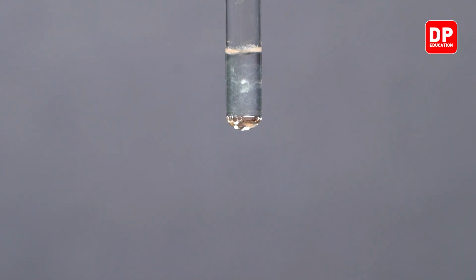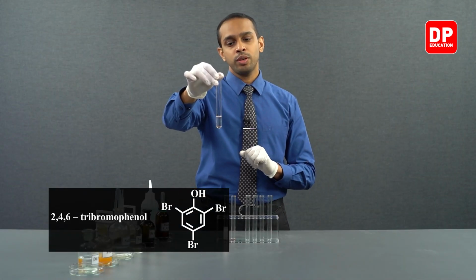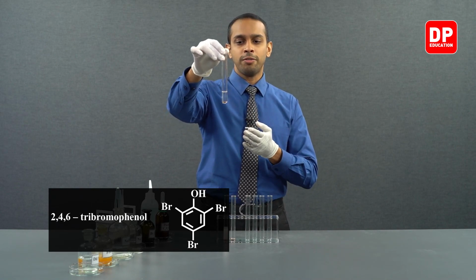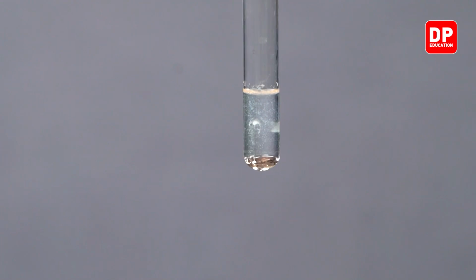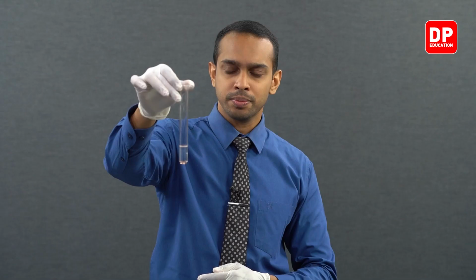What happens here is when phenol is added to bromine water, the bromine reacts with phenol to form tribromophenol, which is insoluble in water, which is a white color precipitate. So, the color of the bromine water disappeared and it formed a white color precipitate that is suspended in the aqueous medium here.